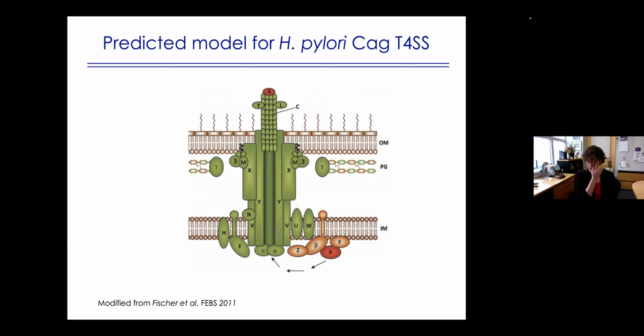And when we started the project, we were working with a very talented student, Arwen Frick Chang, in Tim's lab, who had an idea of how she wanted to purify this complex. And I only mention this because she was told many times that this was not going to work, but she persisted. So this is the cartoon of CagA here. And so she decided she was going to try to purify the complex using this chaperone called CagF that seemed to bind to CagA, and use this as the handle for pulling down this entire complex.